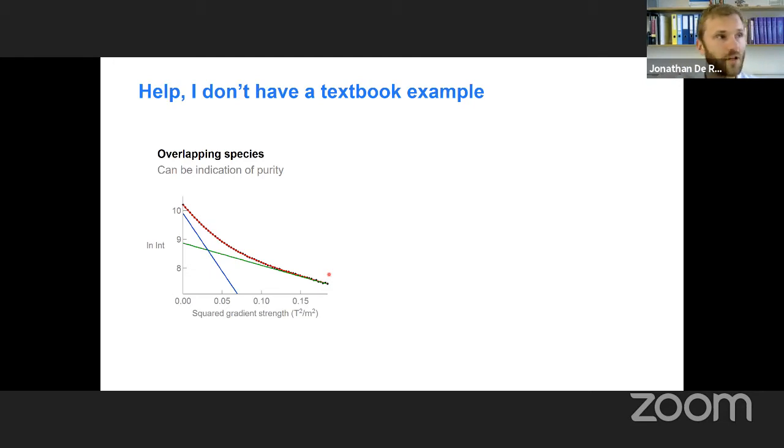Now this is a situation that often happens when you have still free ligand around. It appears, especially in chloroform, the free ligand and the bound ligand overlap. We don't have this problem in toluene or benzene, but in chloroform they overlap. And if you then look at the decay of the alkene resonance, for example, you will see not a straight line, but this curved line, which you can fit with 2 straight lines. So here you can fit then the slow diffusion coefficient and the fast diffusion coefficient. The fast one belongs to free ligands, and the slow one belongs to the bound ligands.